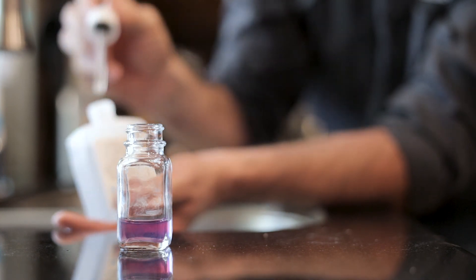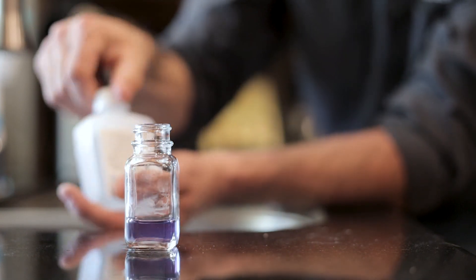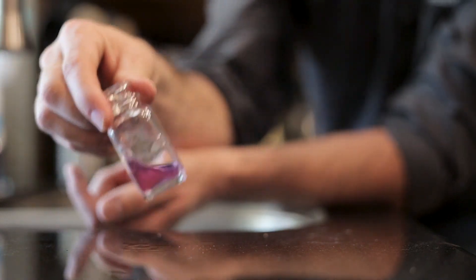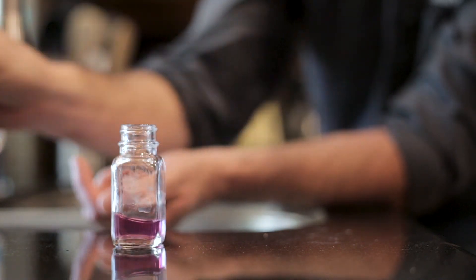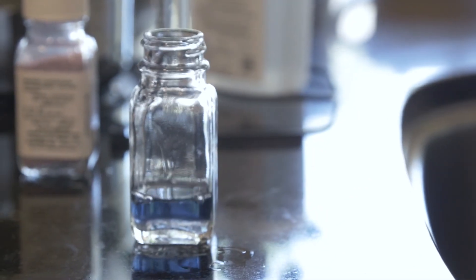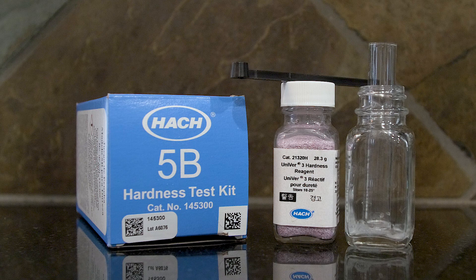It took about 18 drops to turn the solution purple, indicating that our water is 18 grains hard. Typically we should have zero grains of hardness, so when we put our water into the solution it should have turned purple instantly. So we just found out our water softener is not working correctly.